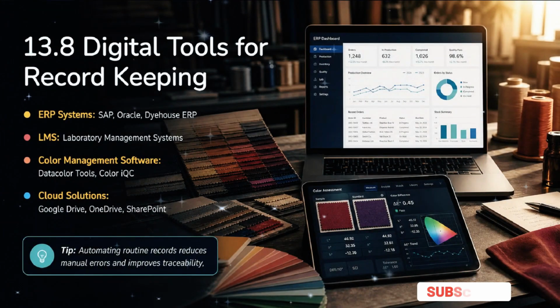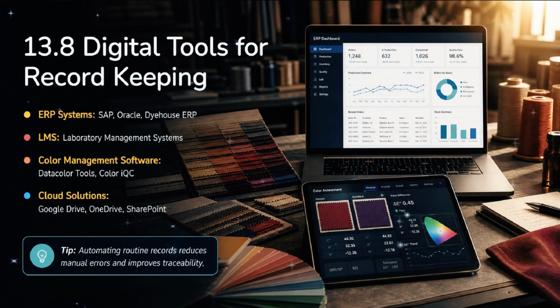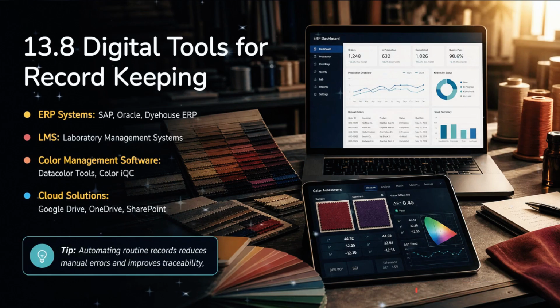Leverage digital tools to streamline your record keeping. ERP systems, laboratory management systems, and color management software can significantly improve efficiency. Additionally, cloud solutions offer secure storage. Remember, automation reduces manual errors and improves overall traceability.